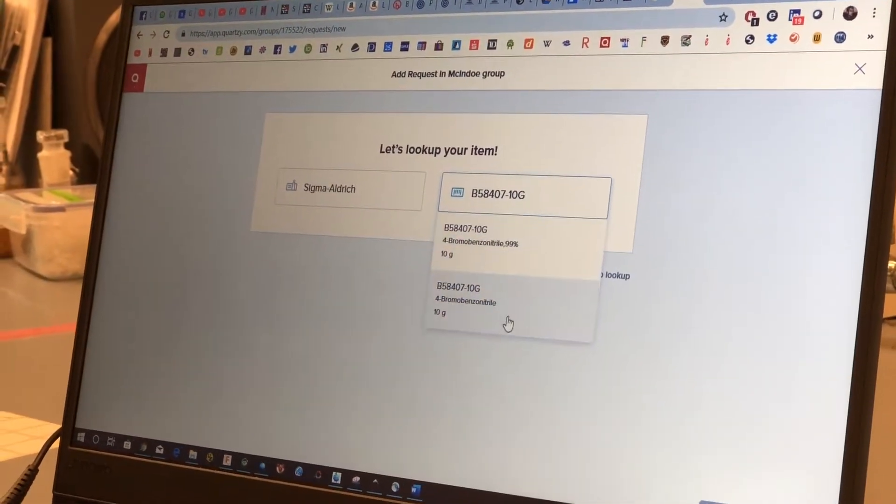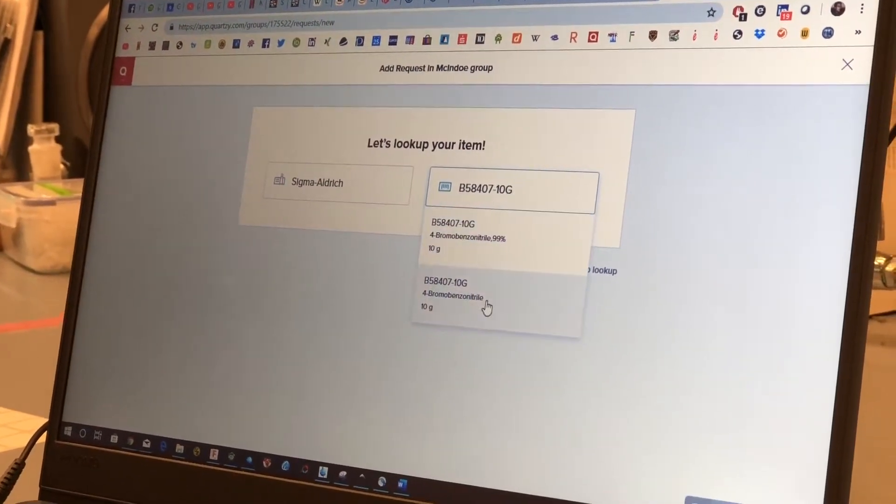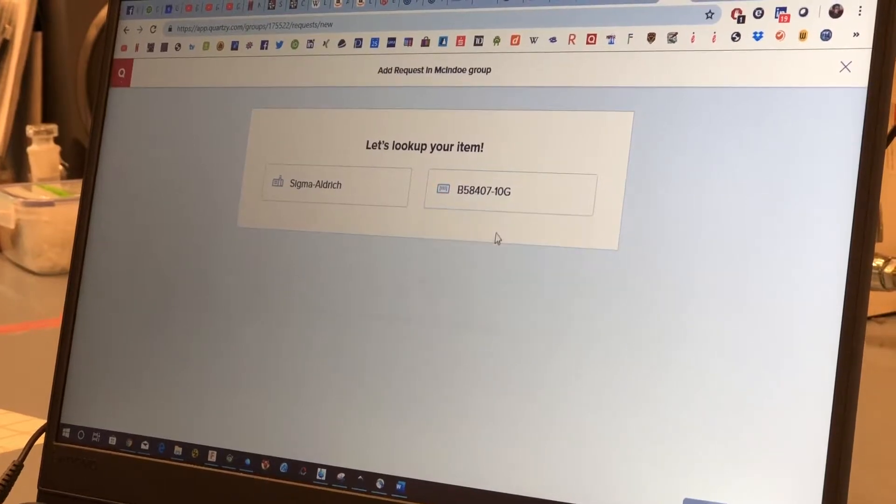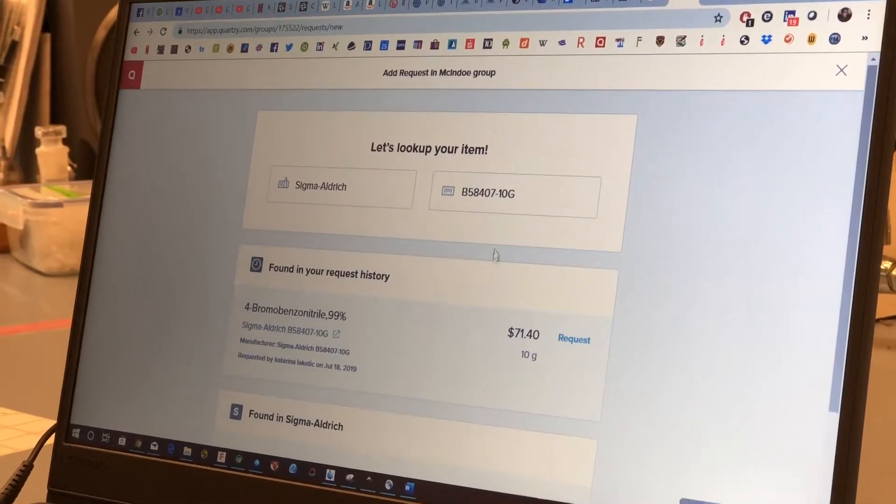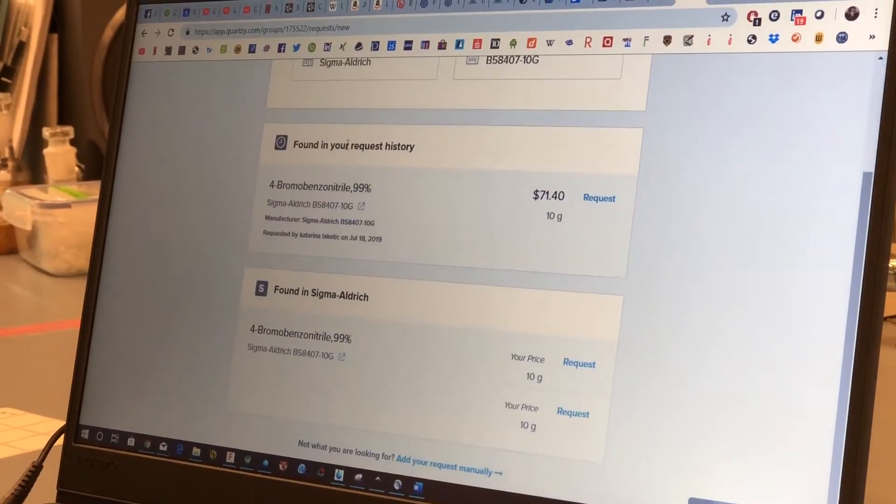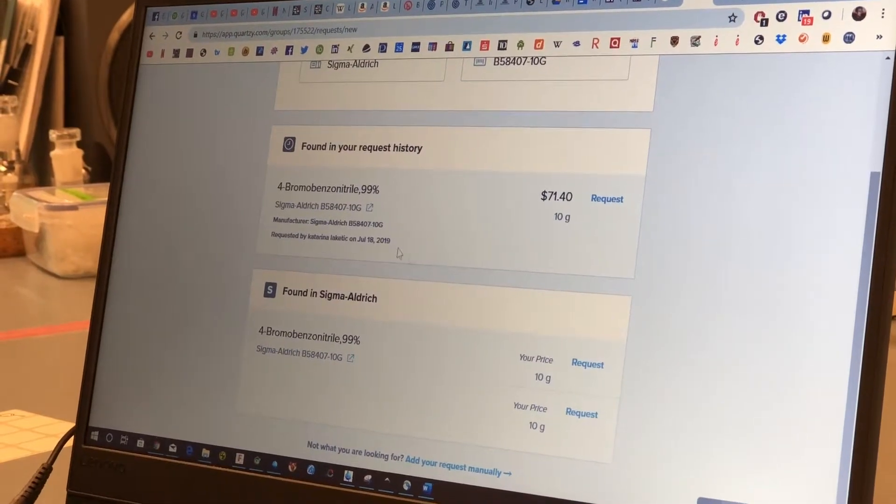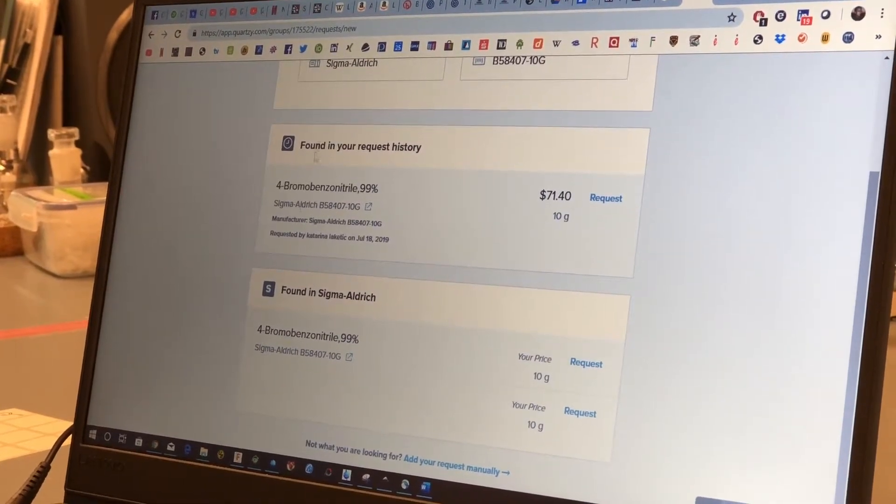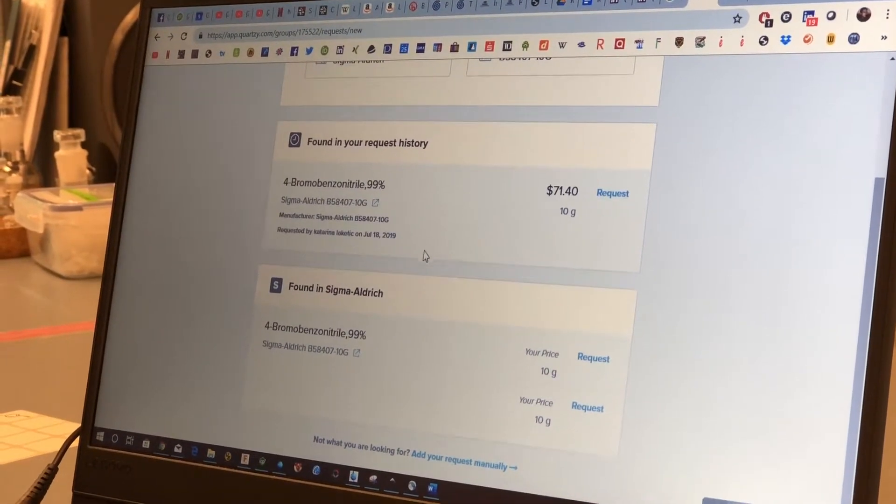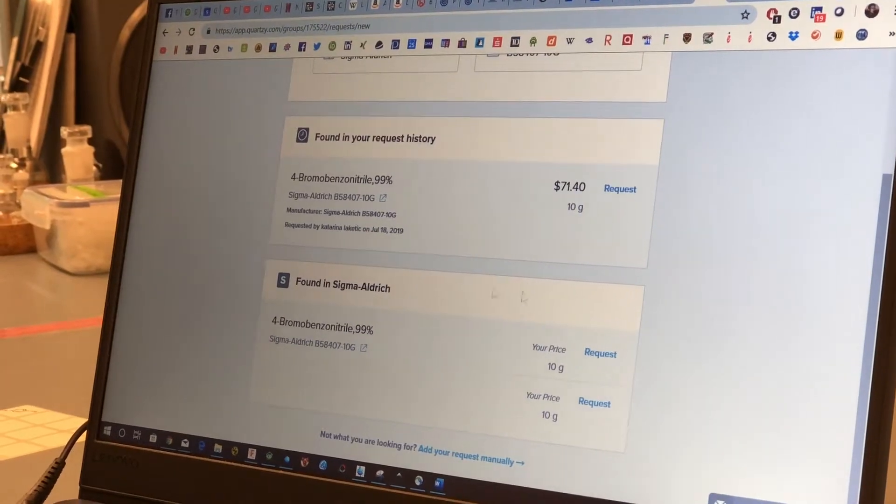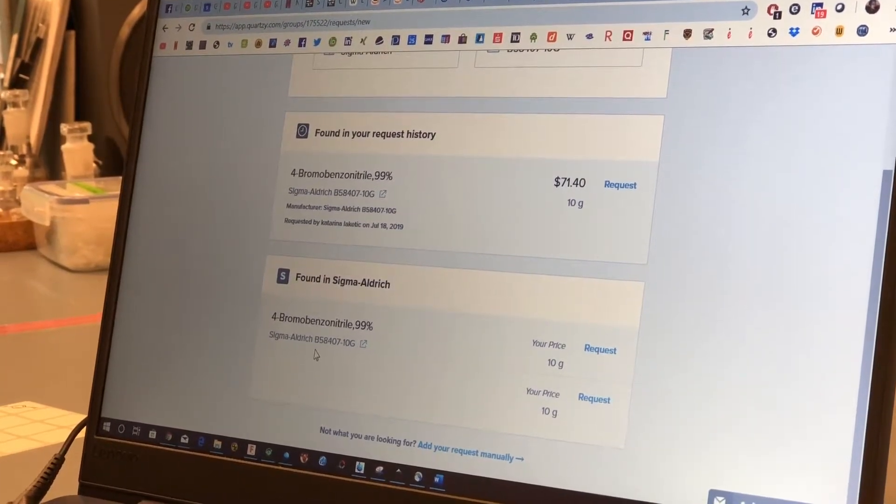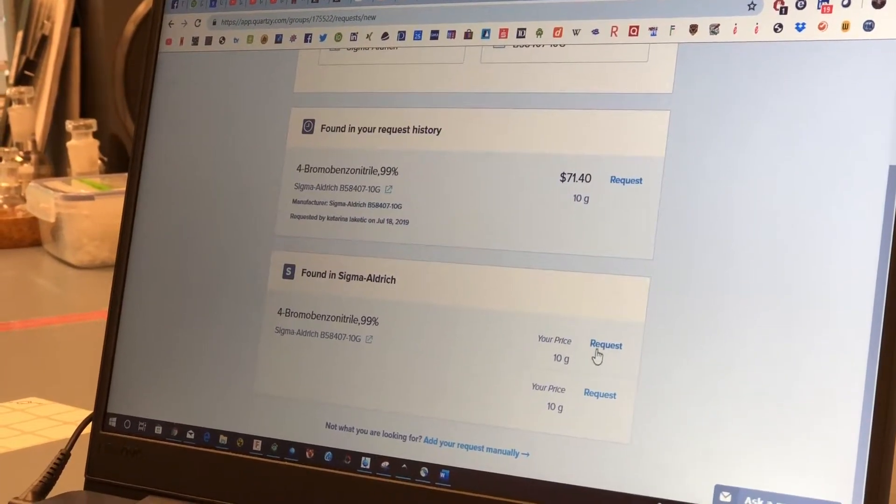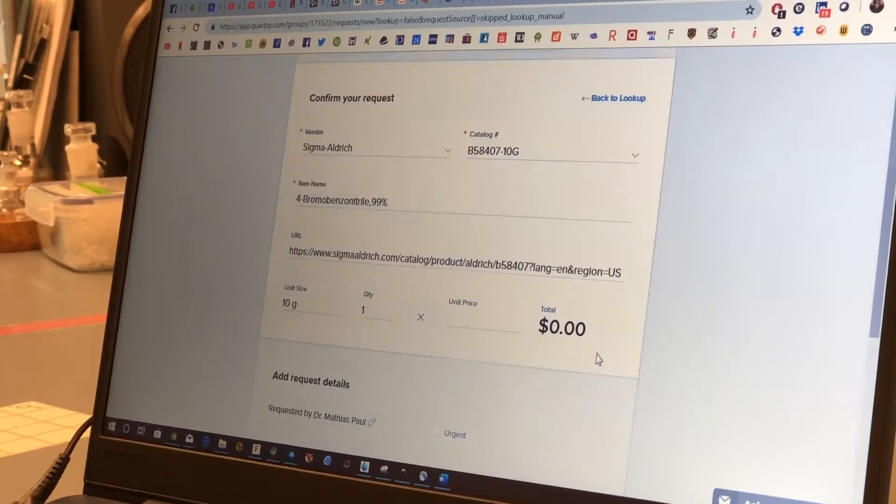So sometimes there are doubles showing up but this is the same. Just take the first one. In this case you can see that we ordered this previously so it remembered all of that but normally you will just find this as it shows up and then you click on request.